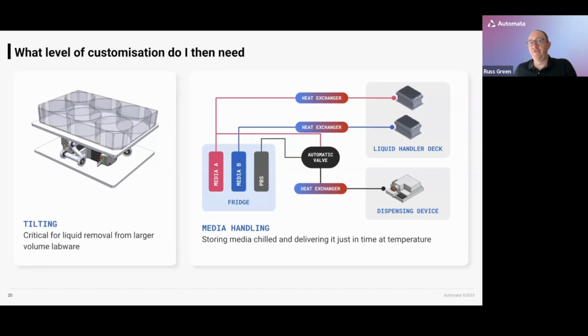Because by changing a few other things in our experimentation, we're now able to take advantage of this huge wealth of plate-based devices that are out there for all of the other functions we need to process a tissue culture experiment.